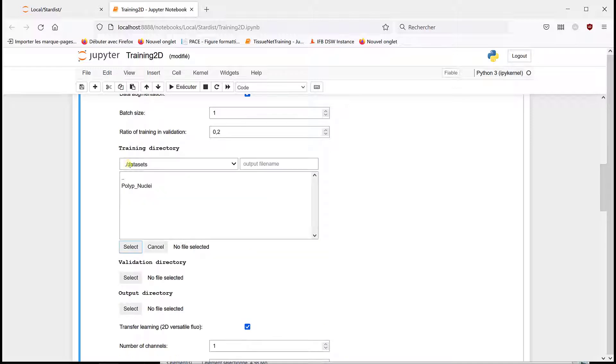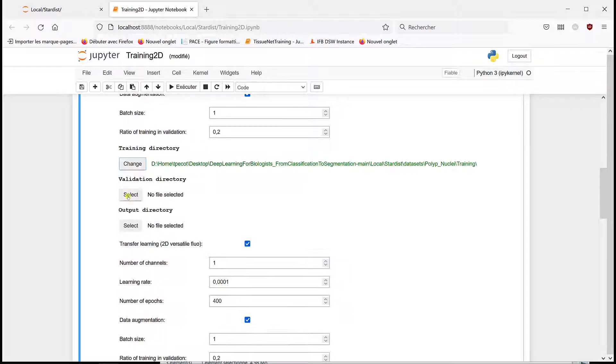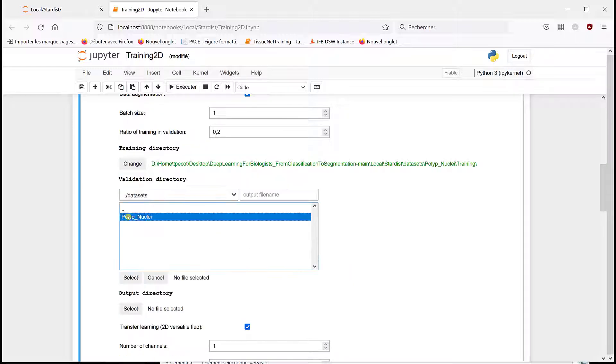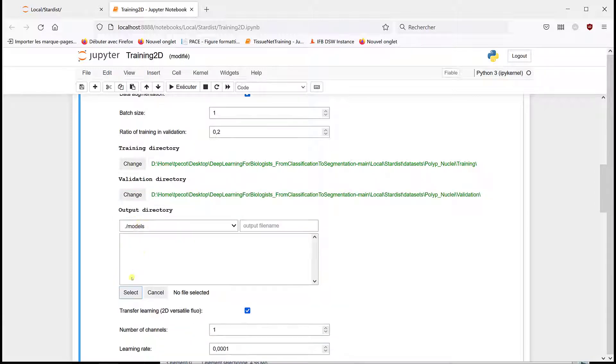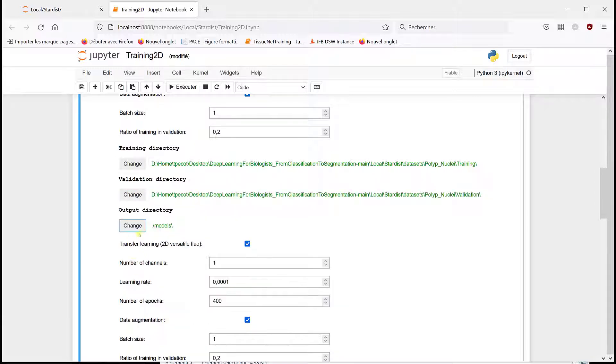And then, I'm going to do the same thing: polyp nuclei training, polyp nuclei validation, right? The same. And this time, we're going to do transfer learning.